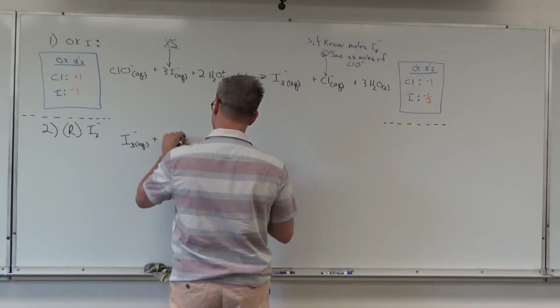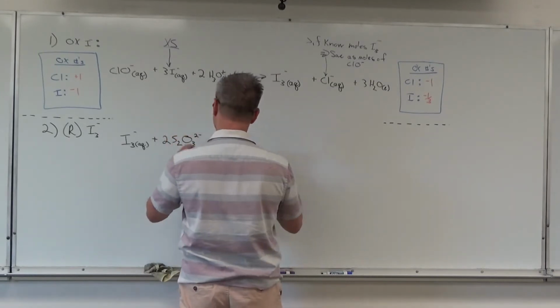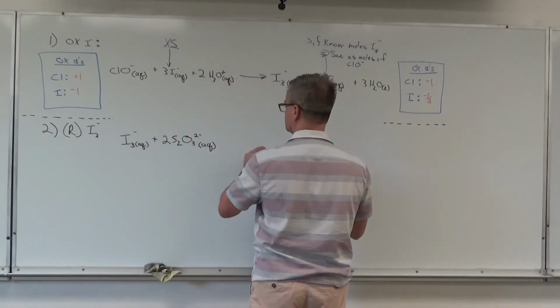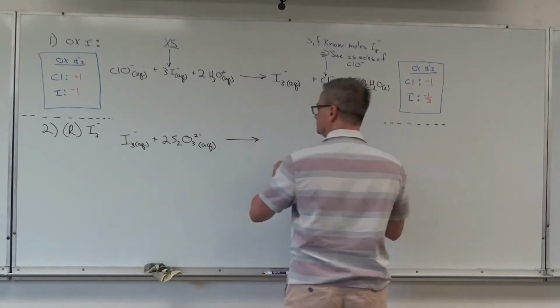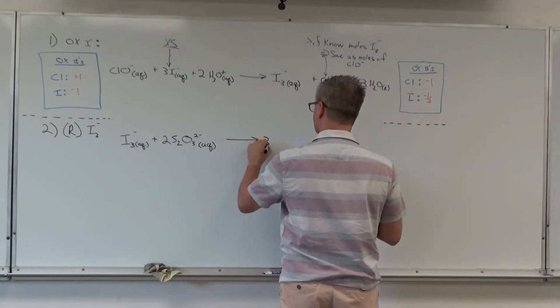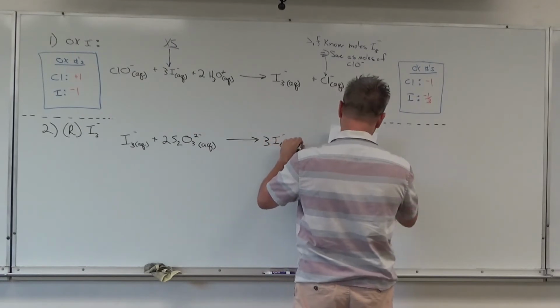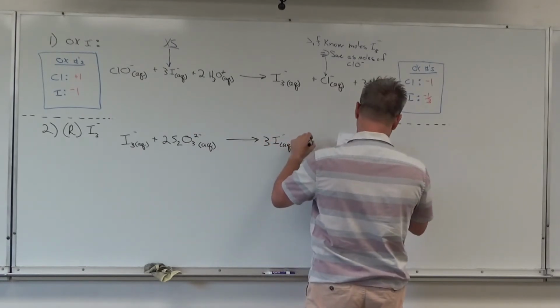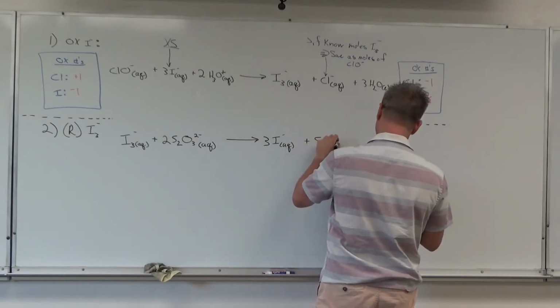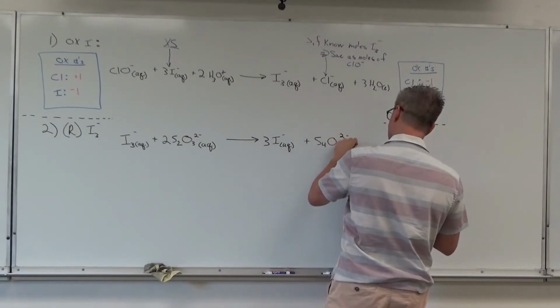That's going to be important. That converts it back into I minus, just iodide, not triiodide, and then the byproduct of our sodium thiosulfate, aqueous.